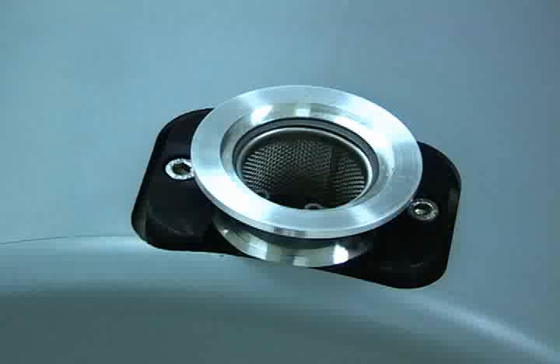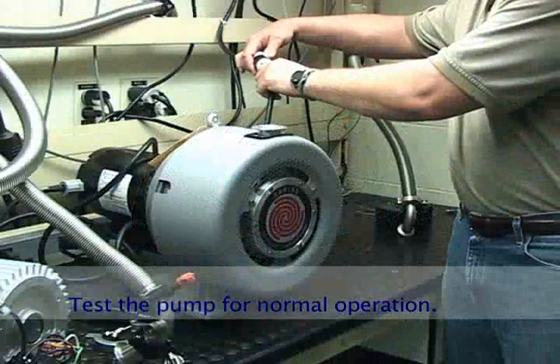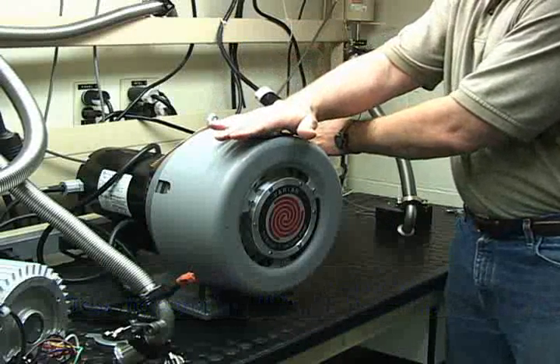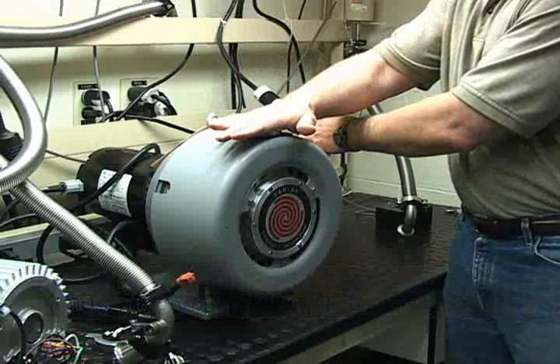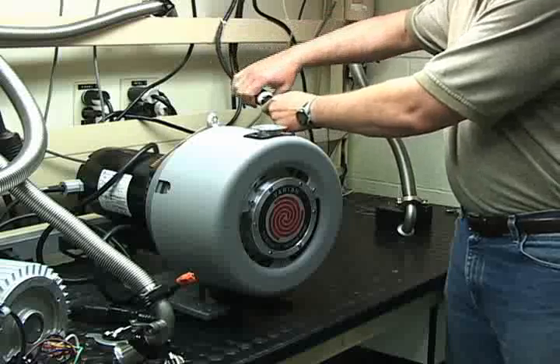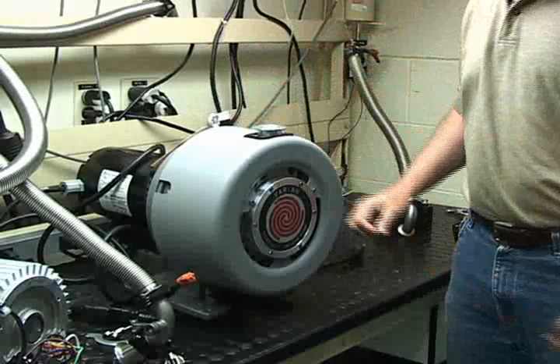Once the tip seal replacement is complete, the pump should be tested for normal operation. Plug the pump in and hold your hand over the inlet, making sure you are not wearing a glove. Make contact with the inlet flange with your palm. If the pump is working correctly, your hand will be drawn to the inlet. Once this is verified, the pump may be unplugged and is now ready for reinstallation on your system.